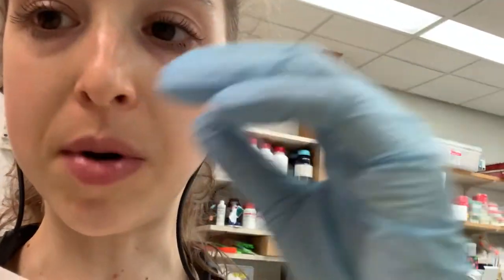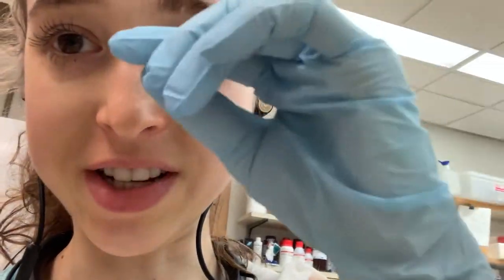For a Western blot you don't need to load as much, because antibodies will amplify the signal. With this approach we're just staining the gel with a Coomassie-based stain — an all-protein stain. If there's not very much protein, you won't see things. You might not see the protein you're looking for, or you might think your protein is a lot purer than it actually is, because you only see a faint band for your protein and there are actually contaminating bands that the dye just isn't sensitive enough to pick up.